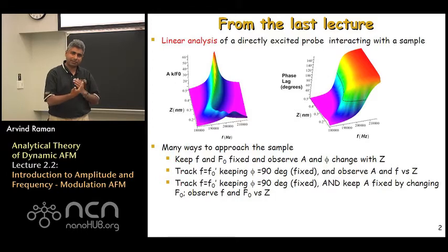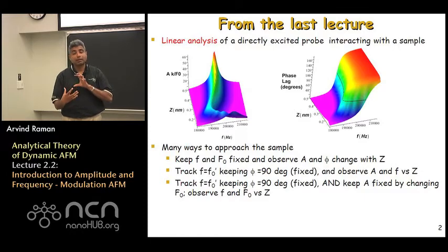The other thing we talked about was the fact that the phase response, which is the phase lag, again, as a function of the drive frequency or excitation frequency, undergoes an interesting transition as you approach the sample, in that the frequency at which you encounter the 90 degrees phase lag changes according to how far you're from the sample and depending on the interaction forces between the tip and the sample.